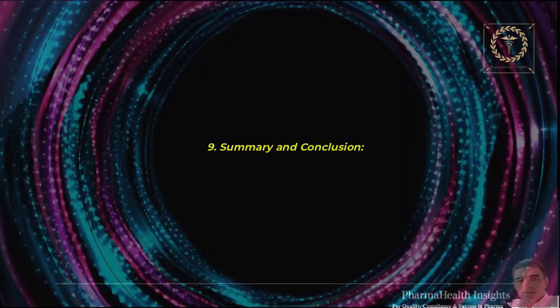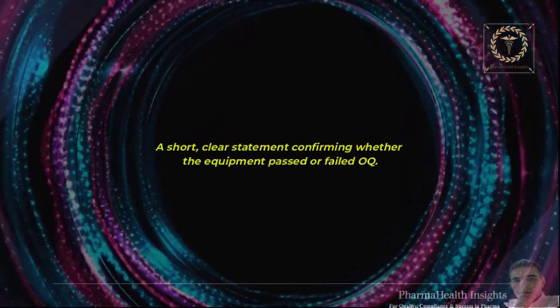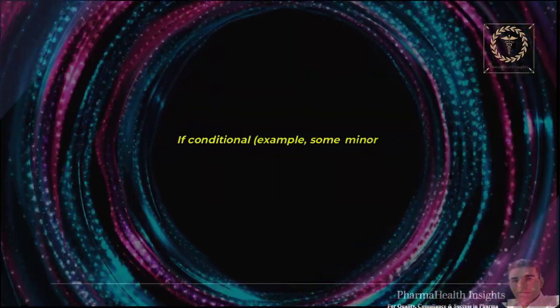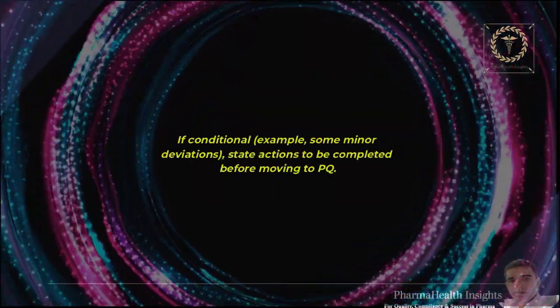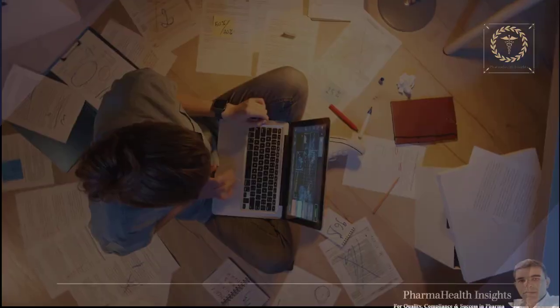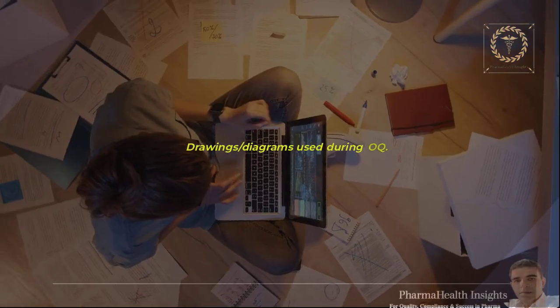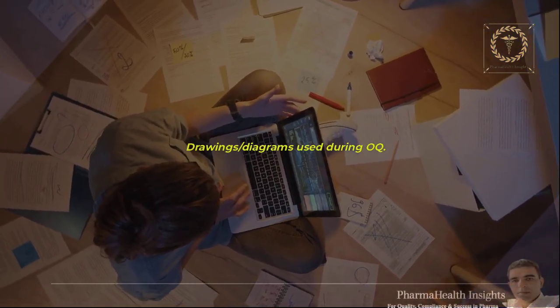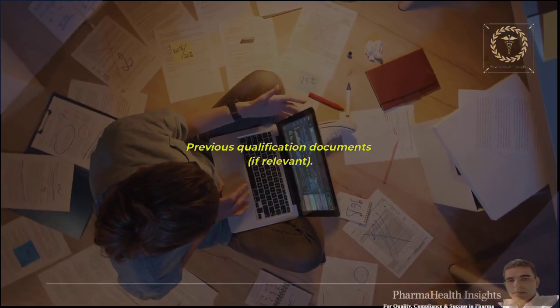9. Summary and conclusion. A short, clear statement confirming whether the equipment passed or failed OQ. If conditional, example, some minor deviations, state actions to be completed before moving to PQ. 10. Attachments, calibration certificates, drawings, diagrams used during OQ, equipment manuals, previous qualification documents, if relevant.